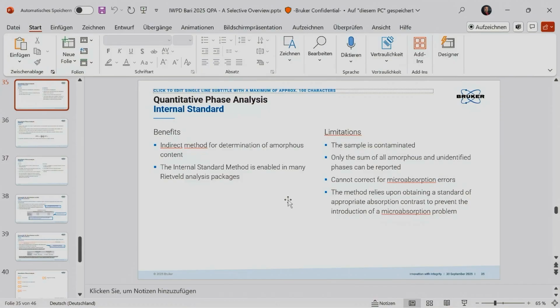And that's actually a very powerful feature with the disadvantage that you have to do this calibration step. So you have to do at least one mixture. Usually this is sufficient. You should also know, however, that this empirical ZMV is only true for a particular wavelength. If you are using a different wavelength in a different instrument, you have to do the exercise again.